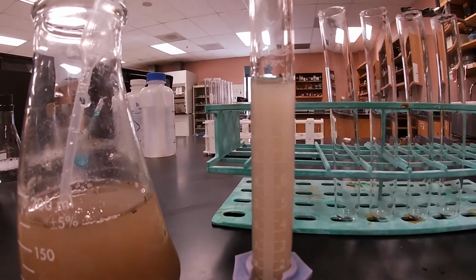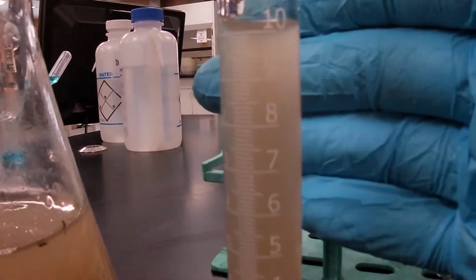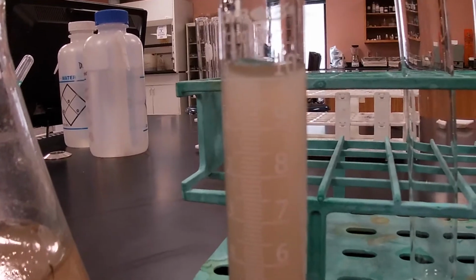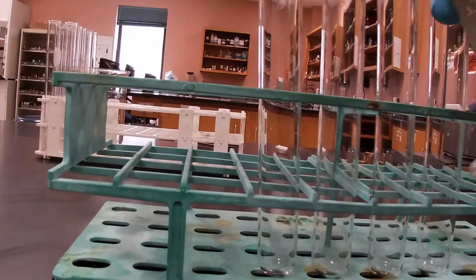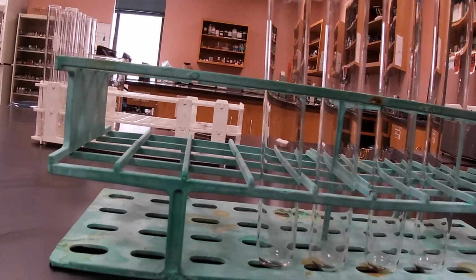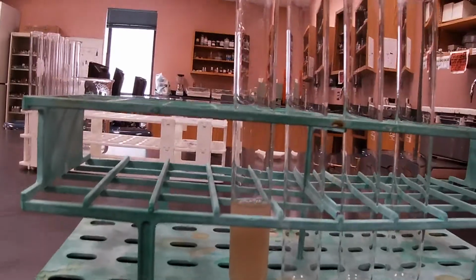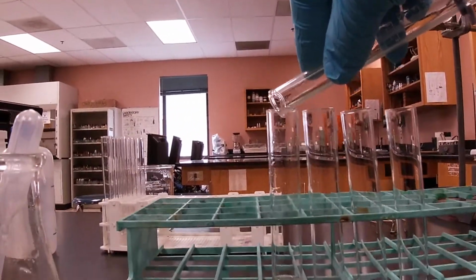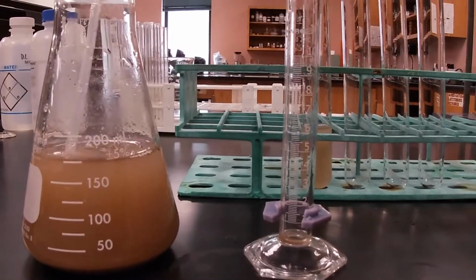And then let's go ahead and zoom in. We said 10 mils, and I don't even know why I'm putting my hand behind it, right? And so I think we are there. We're gonna go ahead and put it as our reference. And then we pour it in. And as we pour it in, we got our first test tube ready. Let's go ahead and get the others ready as well.